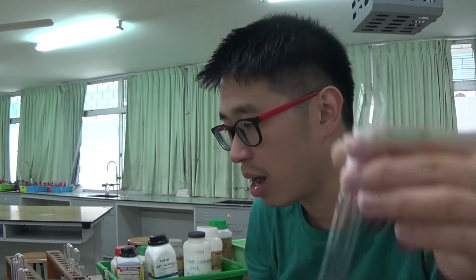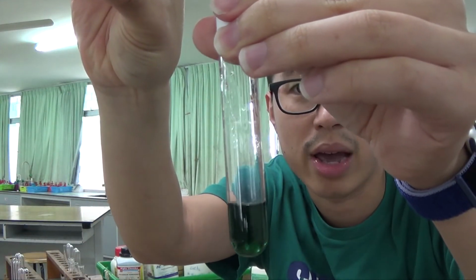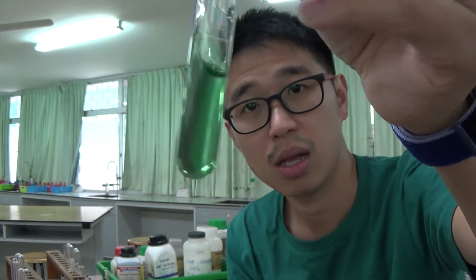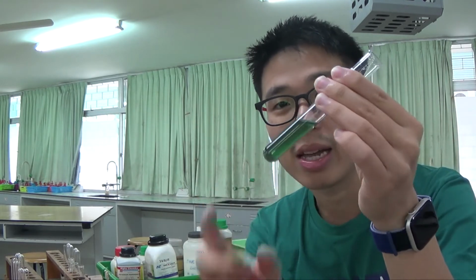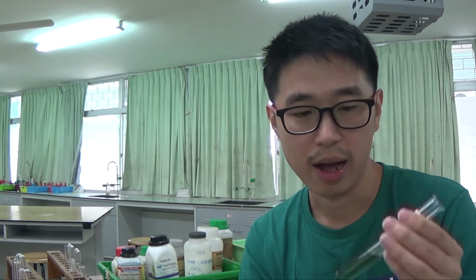It's supposed to precipitate out with a little bit of sodium hydroxide. But when I add a lot more sodium hydroxide, all the precipitate is supposed to dissolve. How then in the world are you supposed to distinguish between the iron 2 hydroxide, which was also a green precipitate? The green precipitate that you get with iron 2+ is very obvious, it precipitated out, whereas the green precipitate that you first obtain with chromium 3+ is very difficult to see, but then when you add too much sodium hydroxide, it will dissolve straight away. They will dissolve in excess aqueous sodium hydroxide.